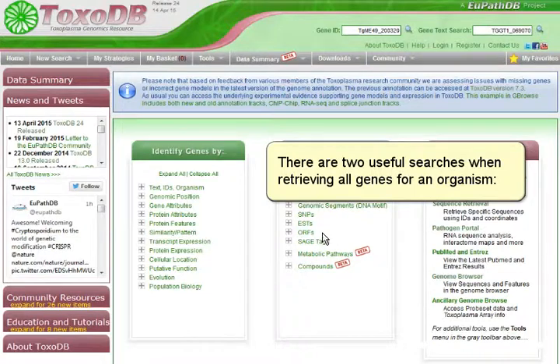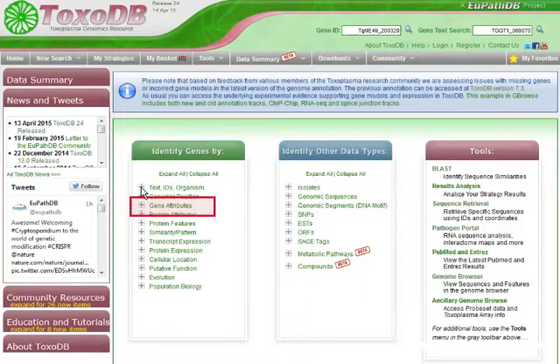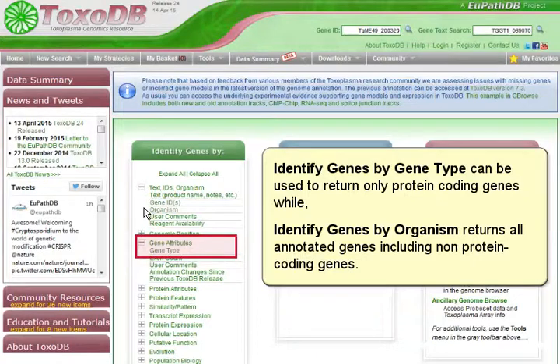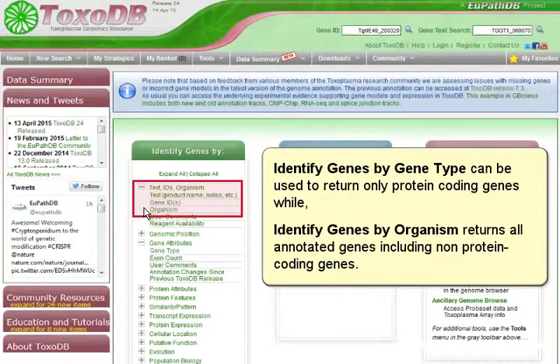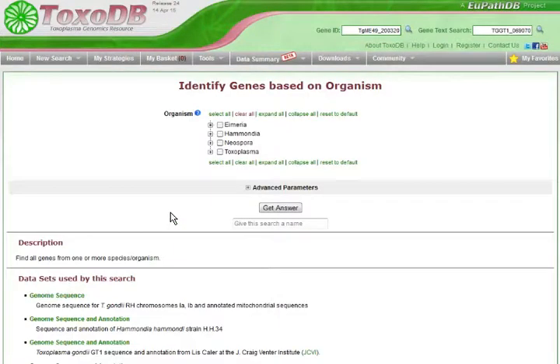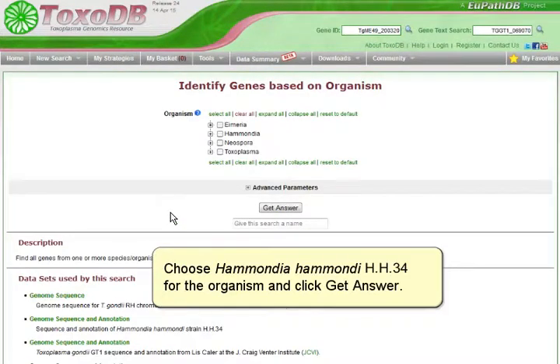There are two useful searches when retrieving all genes for an organism. Identify genes by gene type can be used to return only protein coding genes, while identify genes by organism returns all annotated genes, including non-protein coding genes. Let's run the identify genes by organism search. Choose Haemondia hamondi HH34 for the organism and click Get Answer.